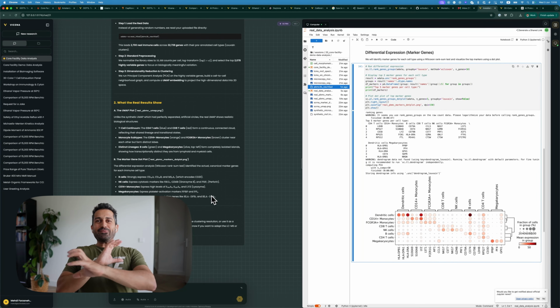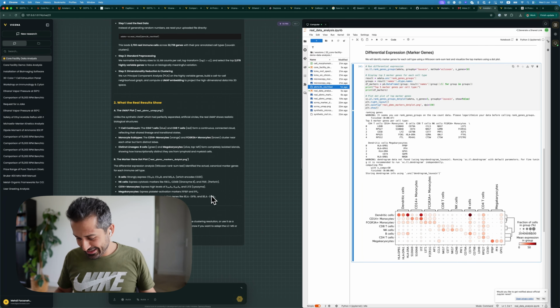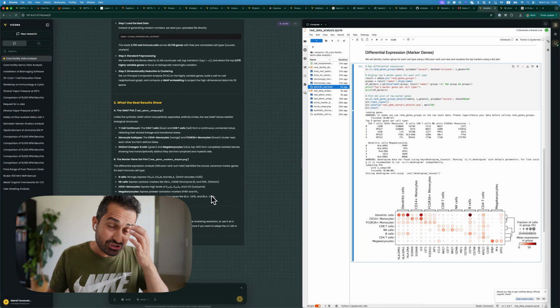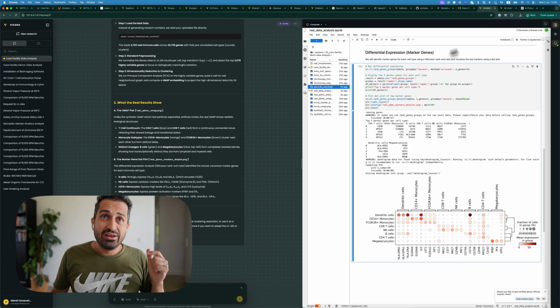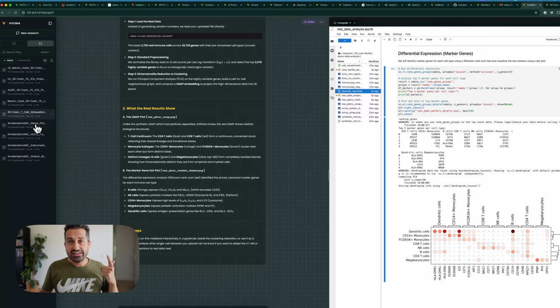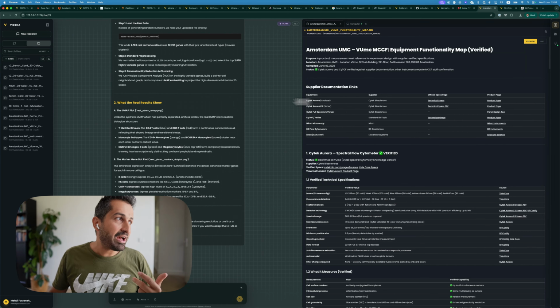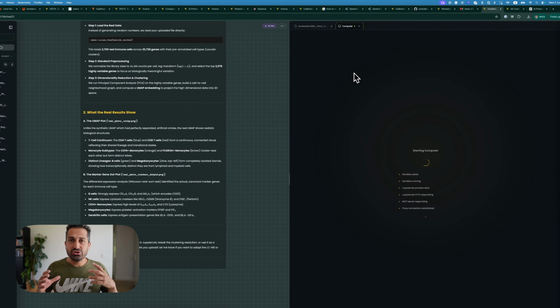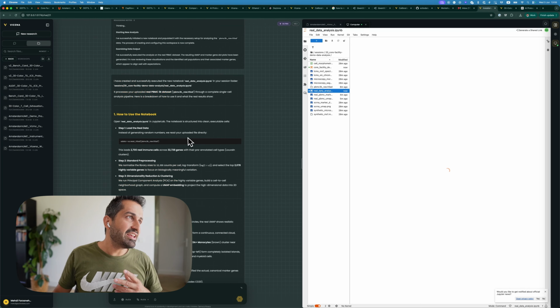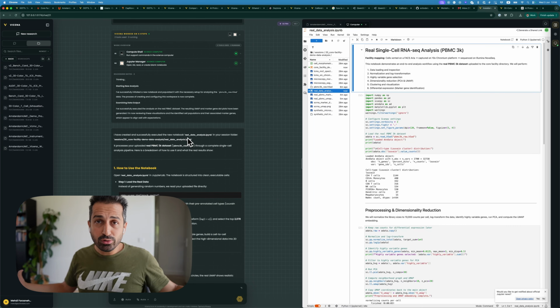So this way we can follow the whole workflow, and I can show you the whole workflow in a biology lab, in an immunology lab. So I now have ways to do literature review. I can design experiments based on the lab instruments that I have and the functionality map, and I can analyze the data, get the insights, get the information using Vicena in an agentic way. So I can follow the whole process.